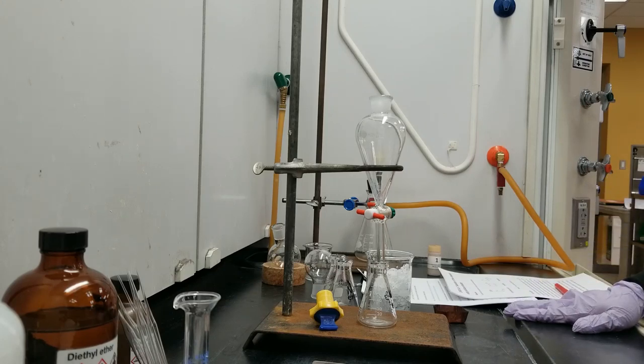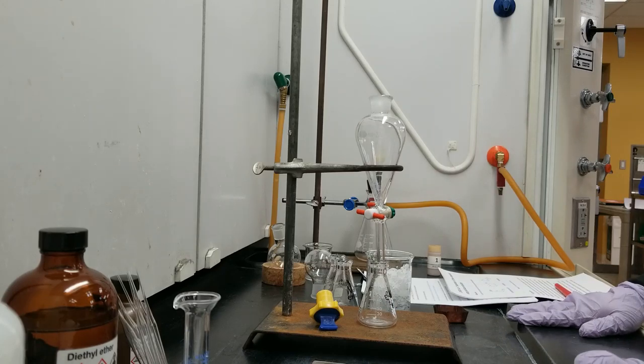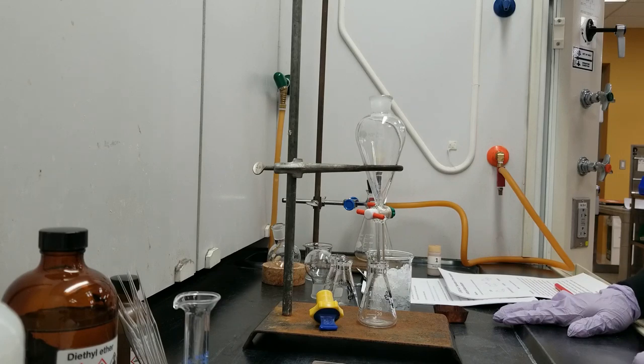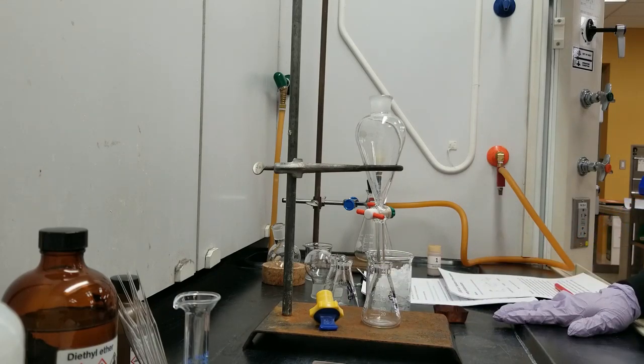And at the end, we'll be calculating the percent recovery for our lab to check how accurate we are, I guess. So, since we don't have a pre-lab, a little bit of backstory for the lab is that normally organic solids are not soluble in water. So we will use the acid-base reaction technique to make the organic solids soluble in water and then perform our lab goal.